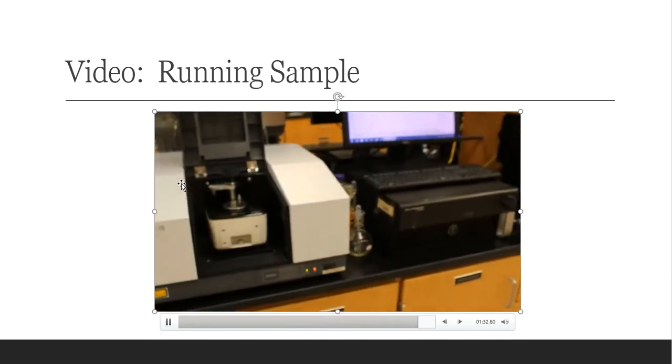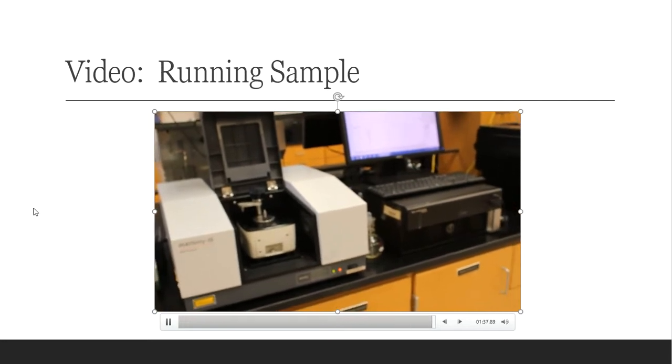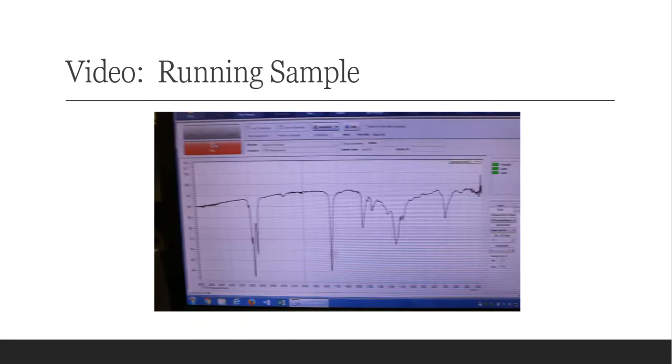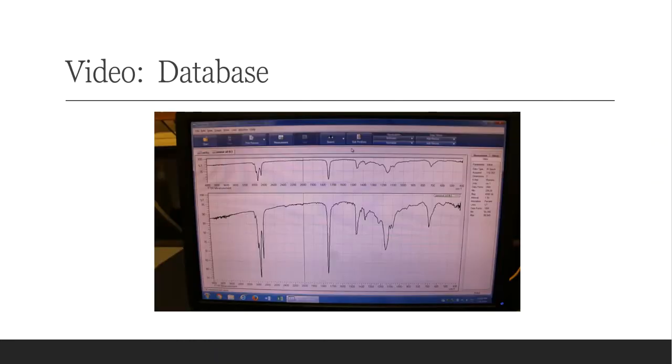All right, so folks, there's the FTIR running with my peanut oil, hopefully. So after about a minute and a half, I ended up getting my FTIR, and this is what the FTIR looked like. Just like what we saw on the screen, again, just a series of lines. You have no clue what this is, and that's fine. I'm not asking you to know what that means, but I need to be able to database search it. I need to figure out what's there, right? Okay, so in this video, we're going to database search it together, and we'll see what pops up.